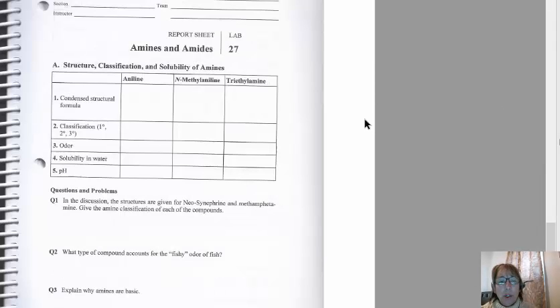So here is the report sheet for part A, and here where it says odor, you can just cross that out. Solubility in water for aniline and triethylamine, as well as the pH, you'll get from the video, and then for N-methyl-aniline you will write your prediction. And I just want to point out, with regard to the solubility in water, that N-methyl-aniline is going to be less polar than aniline because it has an additional non-polar methyl group on that amine nitrogen, whereas aniline has 2 hydrogens on that amine nitrogen. Alright, and then I expect you to answer questions 1, 2, and 3.